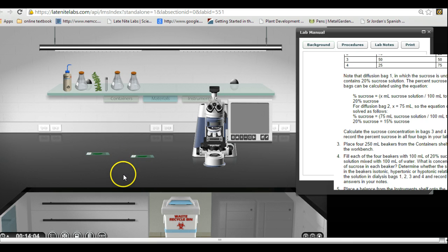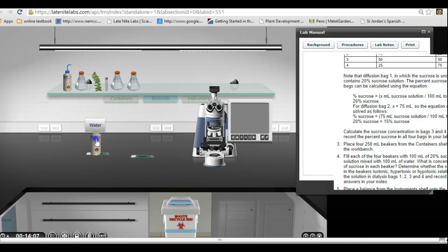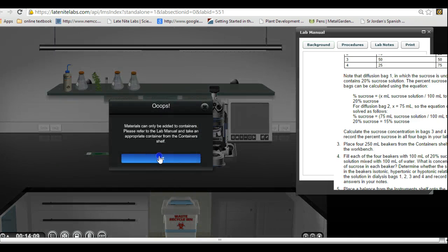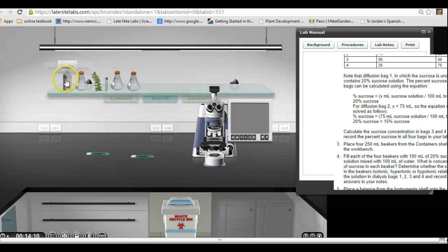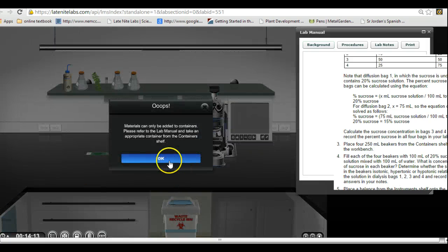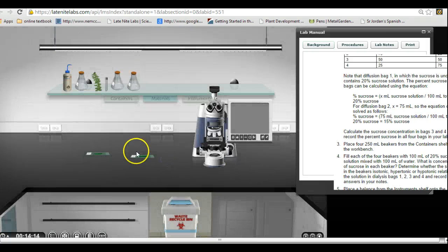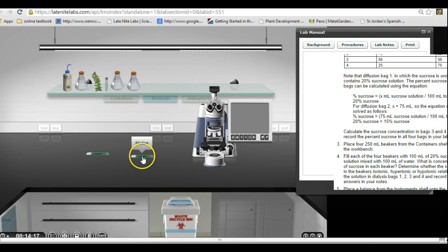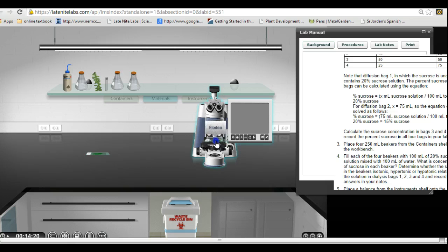There's the water. Now notice right here, if I just set the water right on top of it, it doesn't like it. If I bring the water down here like this, it doesn't like it. So we've got to get it centered on there. Now I'm going to put the slide over here on the microscope.